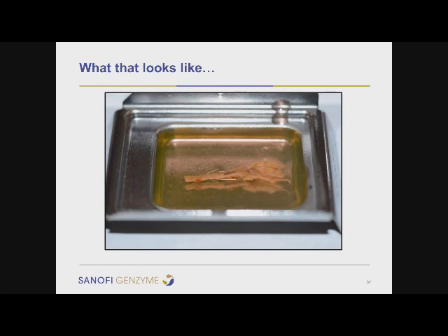And this is what it looks like when the first embedding is complete. You can see there's a little space between the reflection here because there's a layer of histogel at the bottom there. And that's important because I really want to encase the whole aorta in the gel.